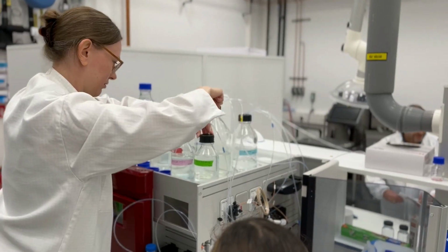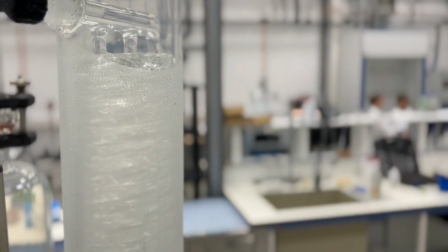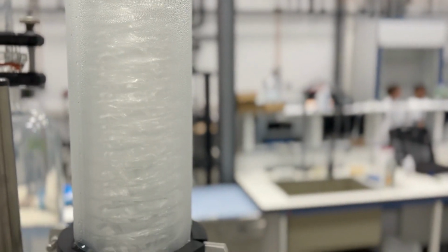This machine, the ÄKTA avant FPLC, is used to further purify the already fractionated samples into separate components. Once our product has been properly purified, we need to stabilize such a preparation. This can be done, for example, by generating a powder out of the concentrated product utilizing spray drying, or by further stabilizing the liquid by rotary evaporation.